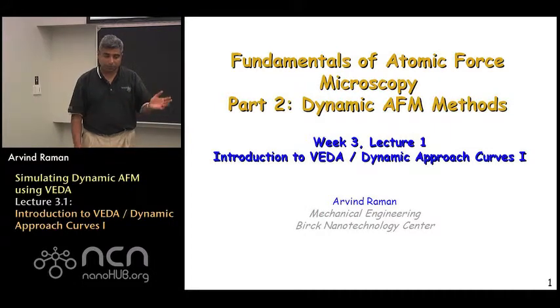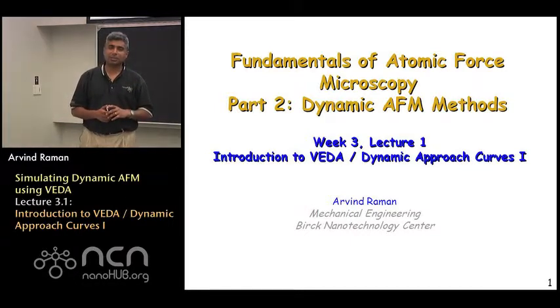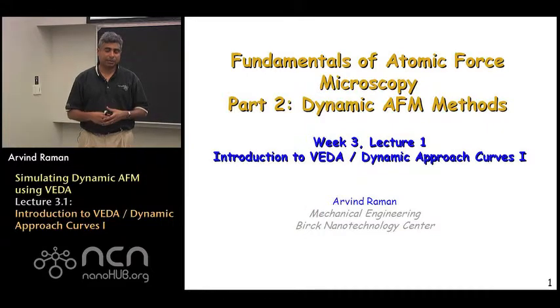But this week we're going to move on to doing numerical simulations of the full equations, the point mass oscillator model interacting with tip-sample interaction forces, and we're going to use VEDA for it. Why use numerical simulations instead of analytical tools? There are many reasons. Analytical tools are great to give you an overall sense of the physics involved, but at the end of the day, if you want to scan a sample and get some really realistic insight into what's happening for your particular sample, you really need to go to numerical simulations.